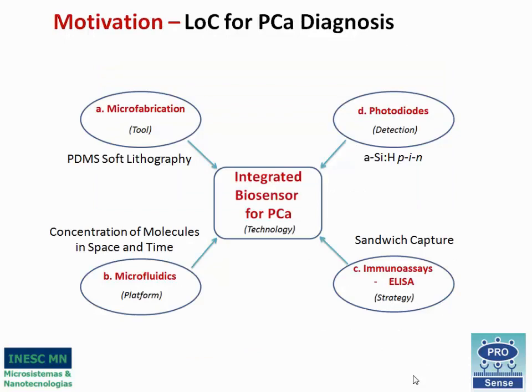Over recent years, biomedical researchers have tried to devise technologies for biomolecular detection that are sometimes limited by hard limits of physics and chemistry. For this, a proper balance needs to be established between various components in an interdisciplinary mode. In this respect, we focus on microfabrication technology underlined by PDMS soft lithography, where we have an aluminum hard mask, the patterns of which are transferred to an SU8 mold, and then we have a PDMS device which is used as a tool.